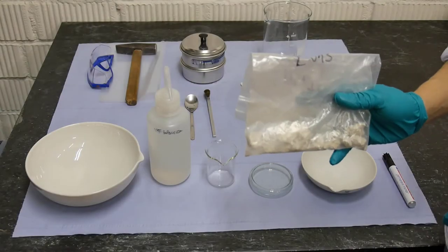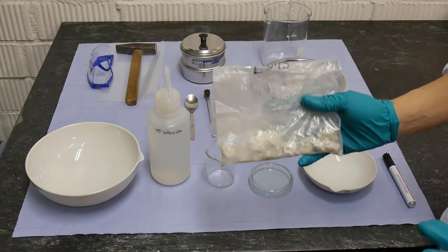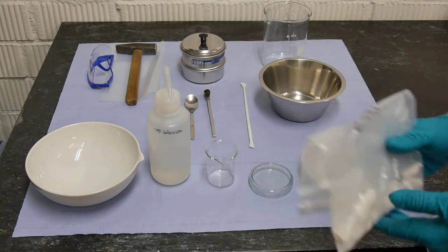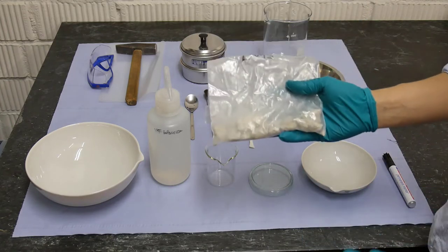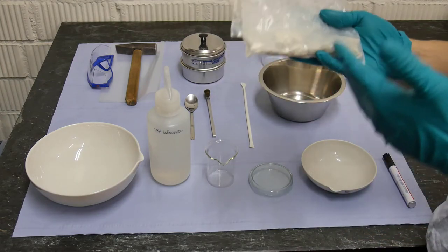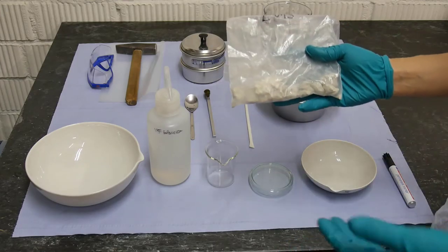This method is really useful when the mineral you are trying to separate is expected to be there — like zircon in rhyolites — but it's not very useful for samples where the minerals are probably very low in abundance, like zircon in andesites. For that type of sample I would suggest using a Wilfley table or something where you can process much more sample.